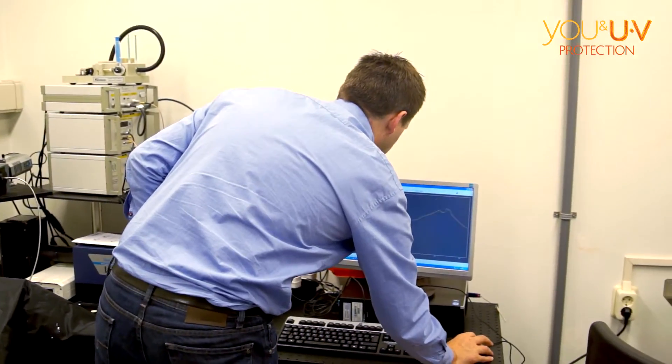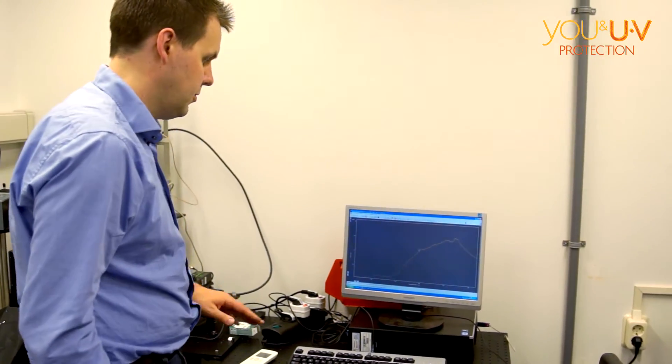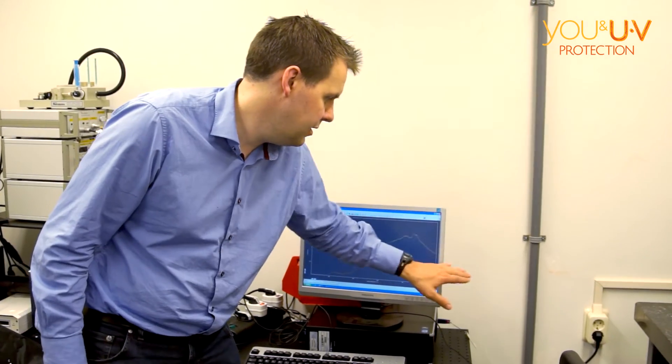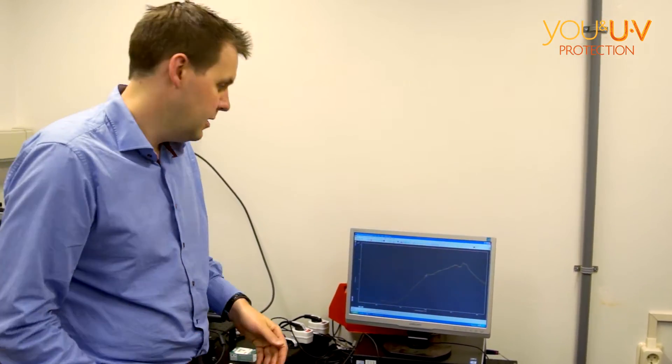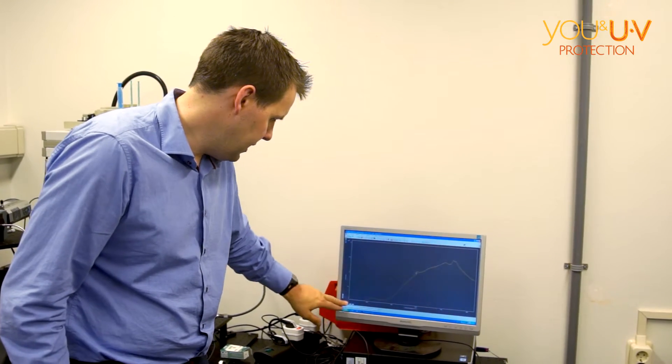This is the light coming from the lamp. Now this is a visible lamp, a tungsten lamp that you use, the old fashioned lamps that you screw in. They get very hot, very energy inefficient, and the reason they get so hot is they have a lot of light in the near infrared, which you feel as heat, radiative warmth. It has very little in the UV.